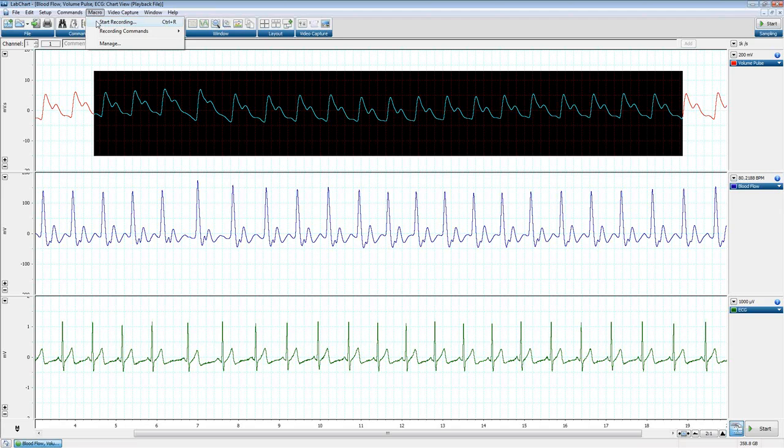It is important to note that, when I'm teaching this course with people in front of me, I'm doing this hands-on in the LabChart training course, one of the things I always warn about is to not ever make a click that I'm not making.